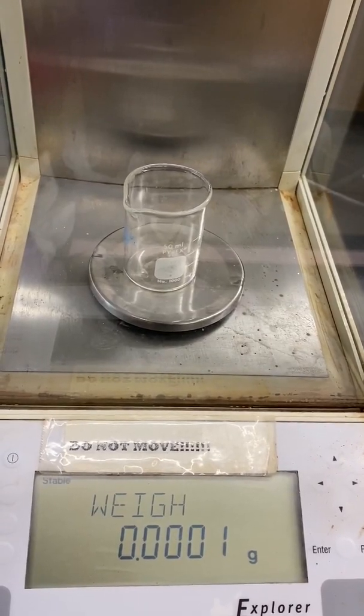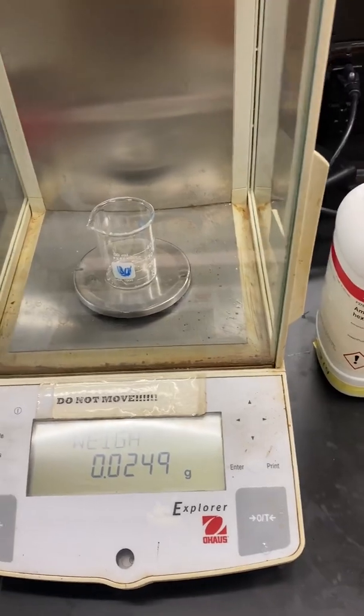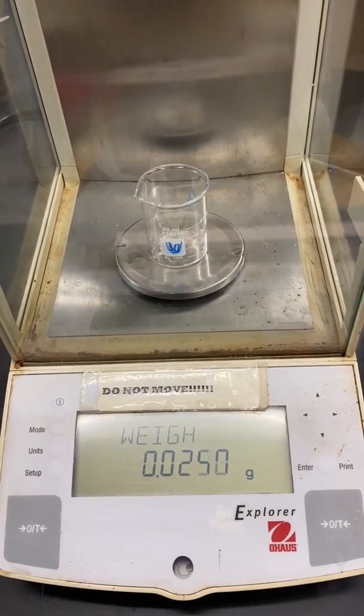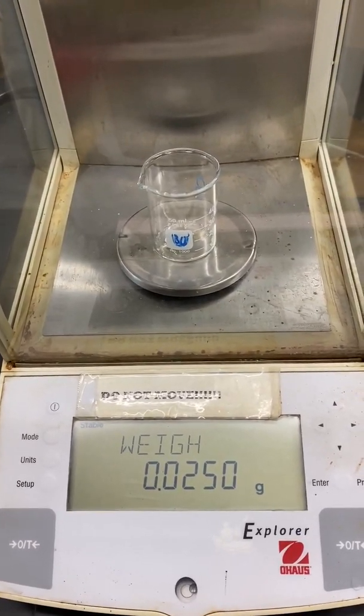Tare a small beaker on the analytical balance. Weigh about 0.0245 grams of ferrous ammonium sulfate hexahydrate into the small beaker — it won't be more than a few crumbs. Record the exact mass.